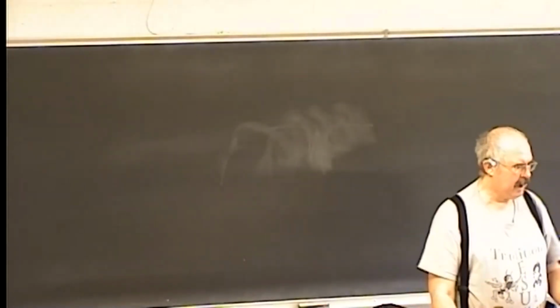This next lesson will be about mass spectrometry. I'm going to share my screen.